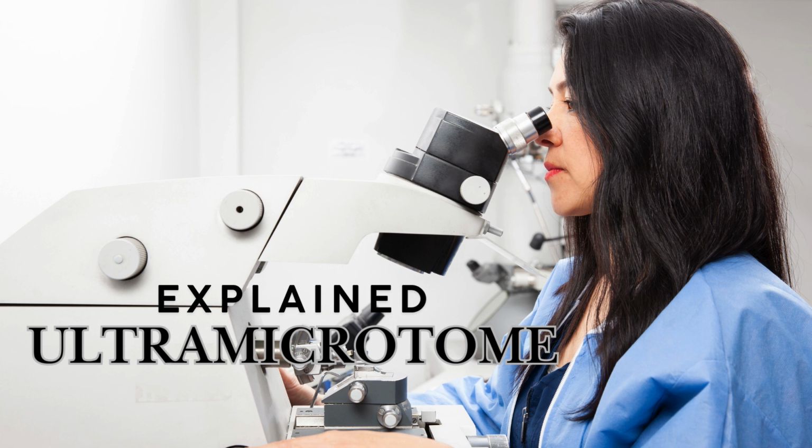So how thin are we talking here? We're talking about 1,000 times thinner than a human hair. I can't even picture that. We're talking nanometers here. To give you another comparison, imagine slicing a single red blood cell into hundreds of thinner-than-paper sections. That's the kind of precision we're dealing with. You need that for an electron microscope, to be able to see all those tiny details down to the molecular level. You need those super thin slices to be able to do that.